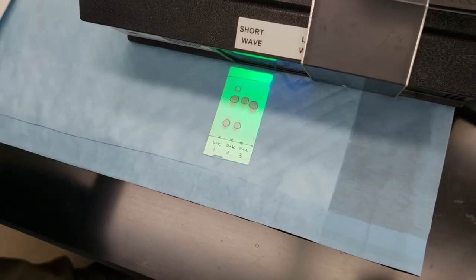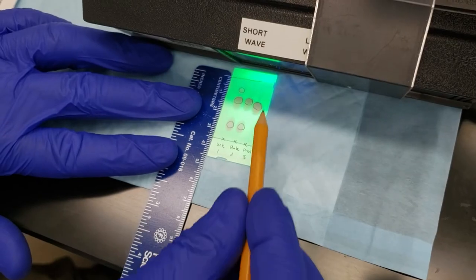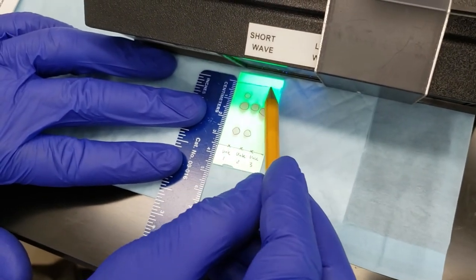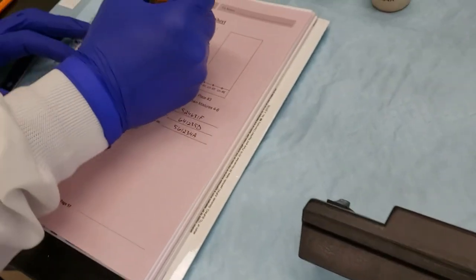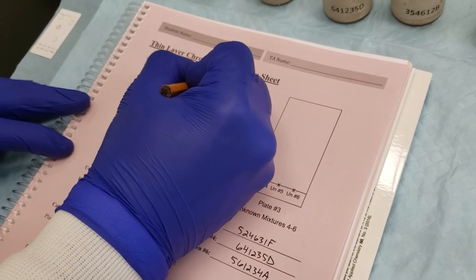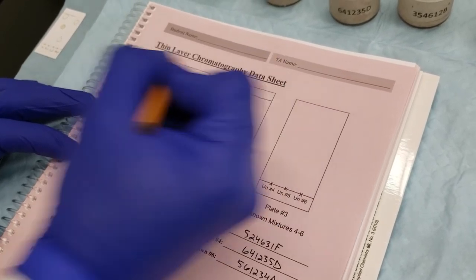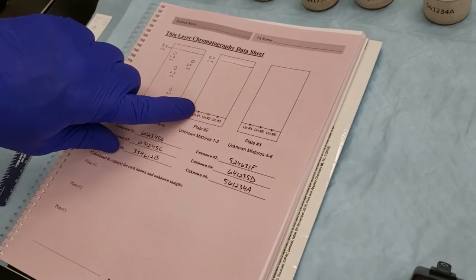First things first, though, let's go ahead and measure the origin line to our solvent front, and that's going to be right at 3.5. We'll come over to our data sheet. 3.5 centimeters. Now we're going to measure the spots for unknown number one.